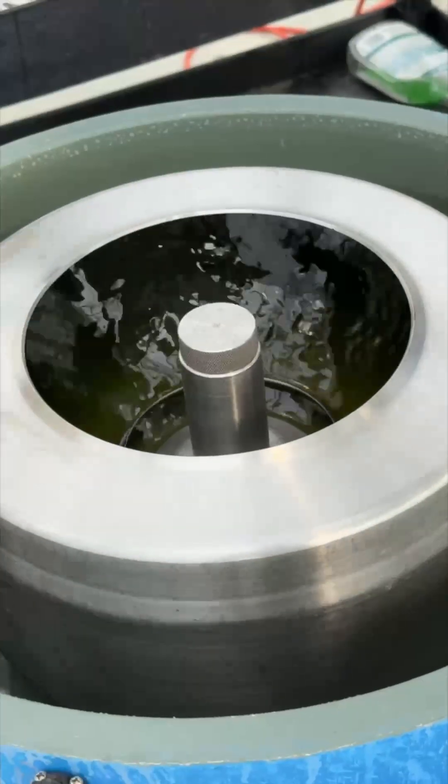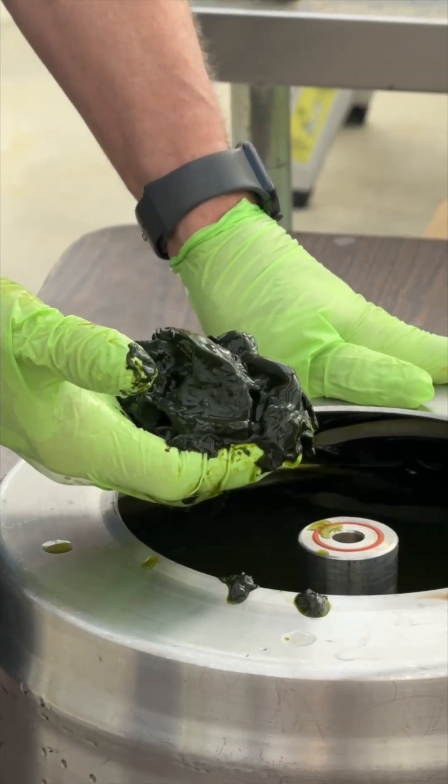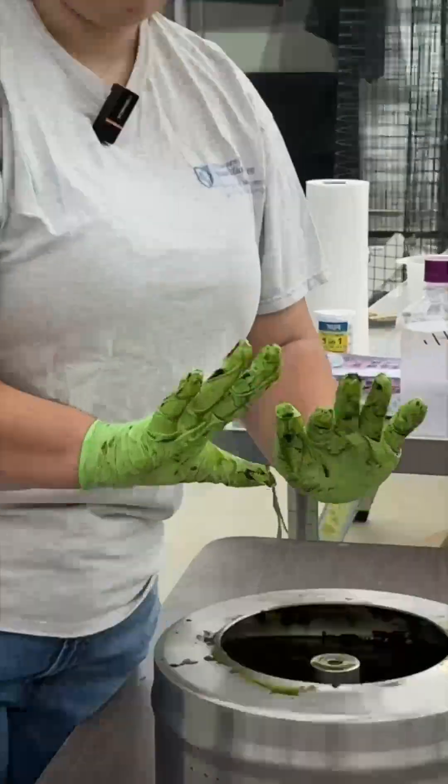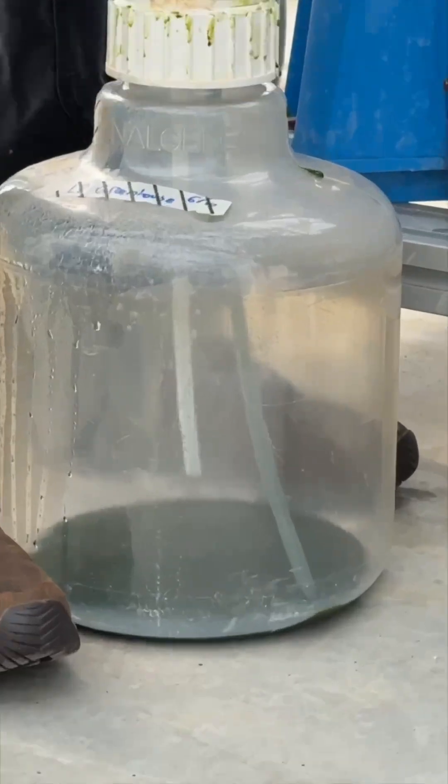Now that it's been spinning overnight, all of that green is the algae that's been collected. Next, we've got to re-suspend the algae so that we have a concentrated algae solution with no chunks. It's very messy, but kind of fun. We will pump this concentrated algae solution into a carboy so that we can take it up to the lab.